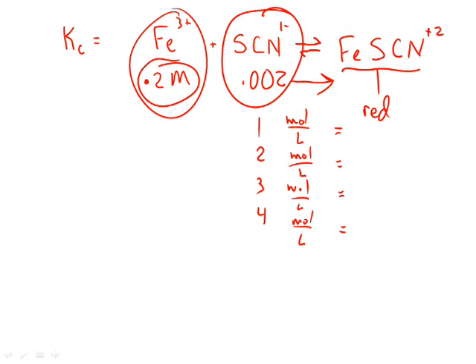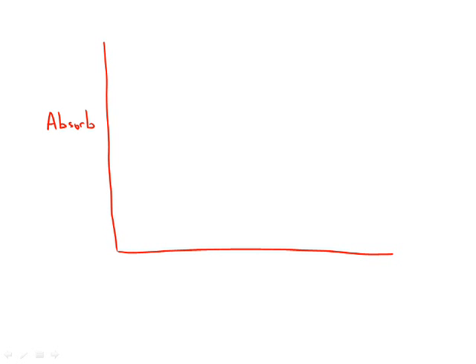And then you collected data points, and hopefully somewhere you have data, or maybe even a graph, so that from the information you have from last week, you can measure the absorbance of any iron thiocyanate solution. You measured absorbance, and down here you're graphing concentration, and you should get a line of best fit that's hopefully pretty close to all your data points.